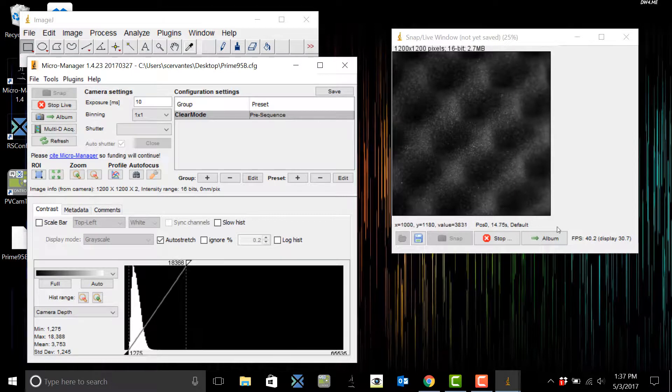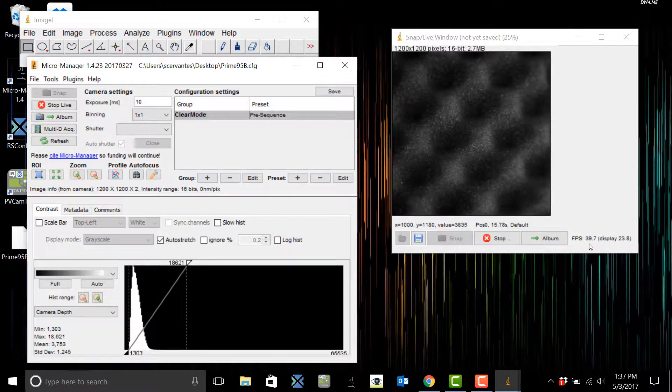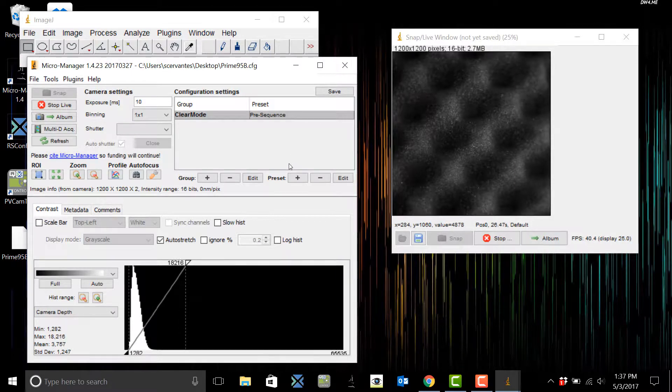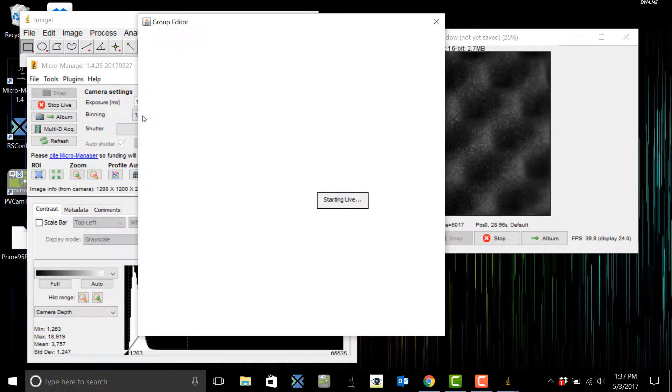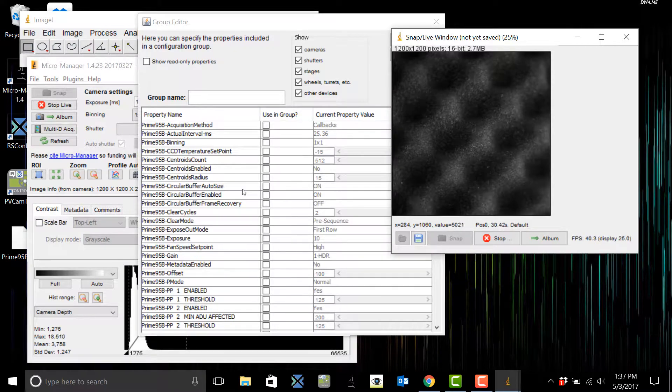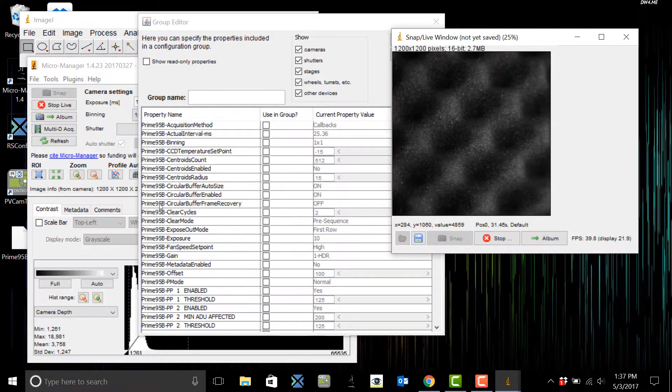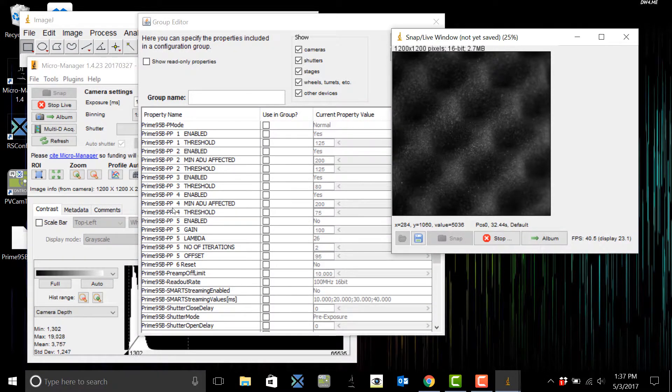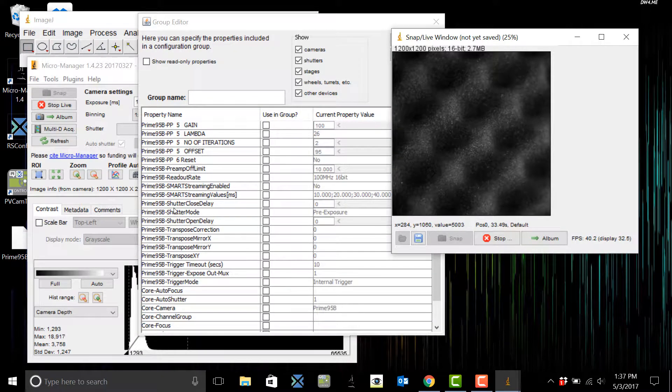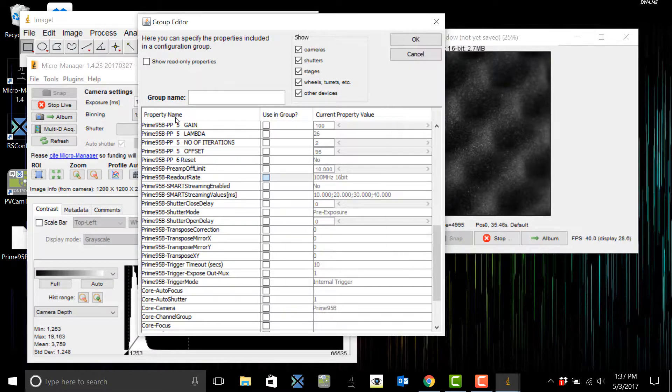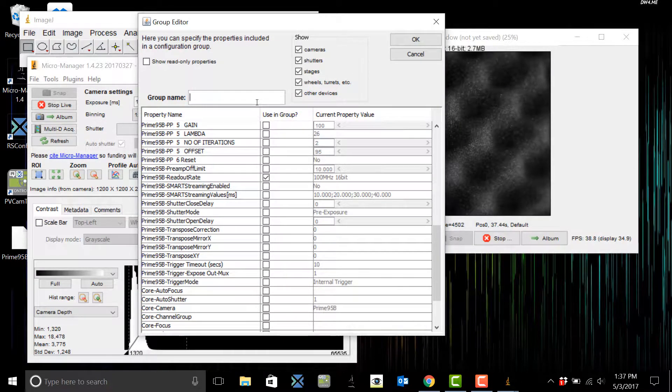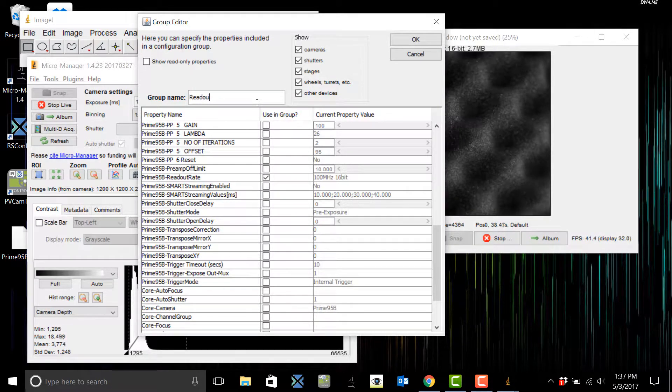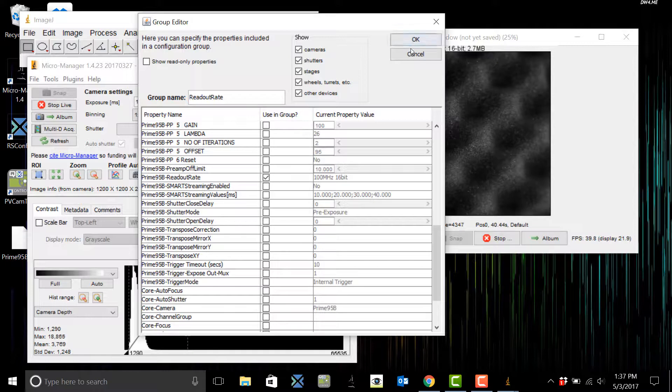OK, now let's add another group and this time we're going to add readout rate. So on the Prime 95b you actually have the option of changing the readout rate and so right now you can see we're running at 100 megahertz with a 16-bit mode.